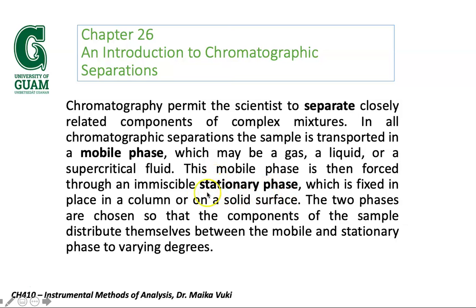Those are the two major systems that operate under chromatography. The mobile phase is the carrier, and the stationary phase is fixed, where it can slow the migration of the analyte.